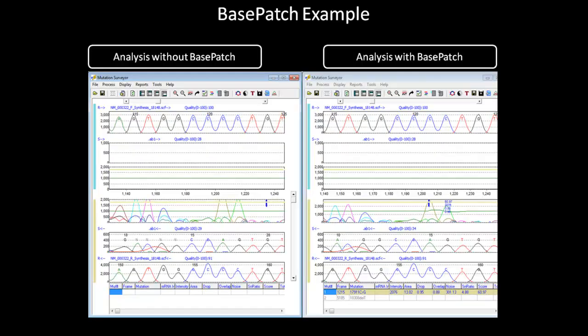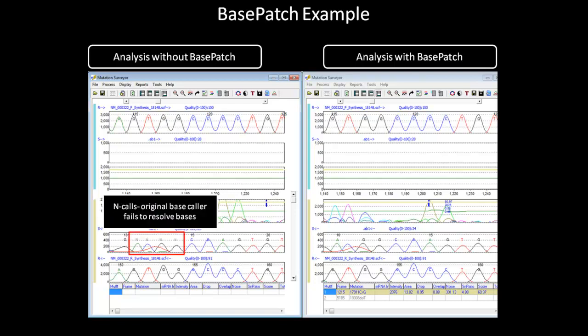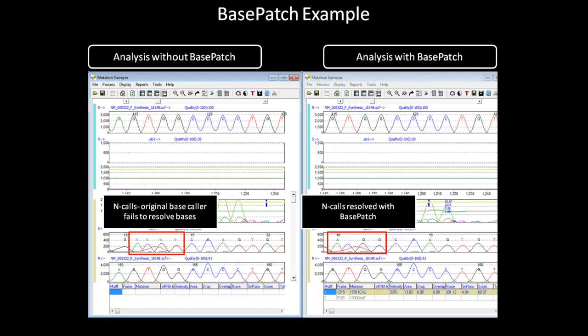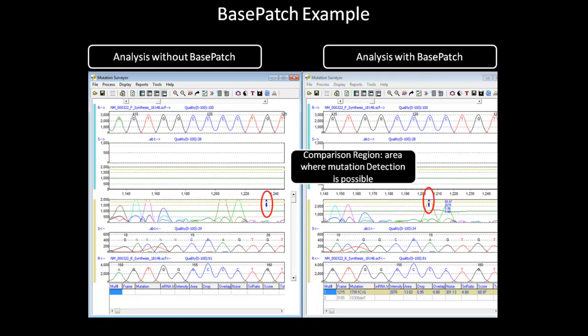In this example, the analysis to the left is run without activating Base Patch, and the analysis to the right is run with Base Patch. The first difference to note is the end base calls on the left side. With Base Patch on, three out of the four end base calls were recalled as their respective nucleotides. These base call corrections allow the software to align the sample trace better and extend the comparison region for more mutation detection.